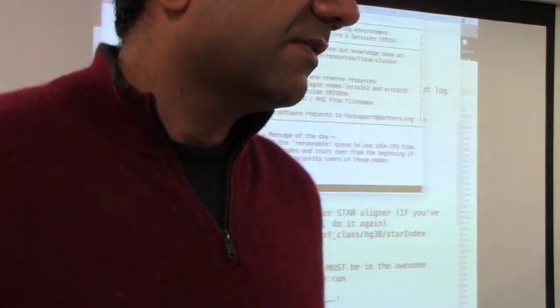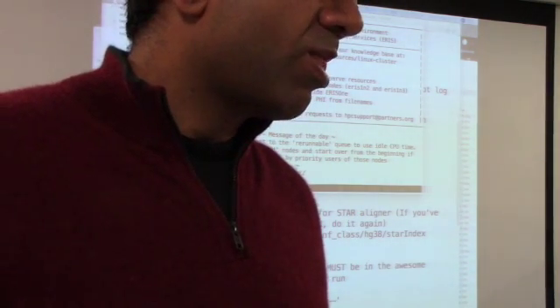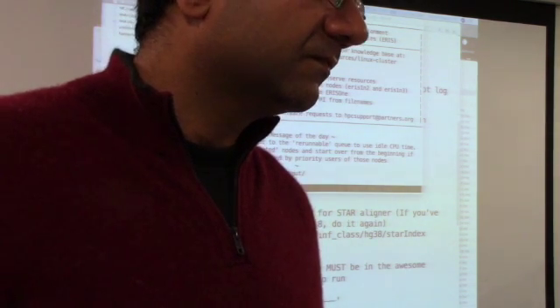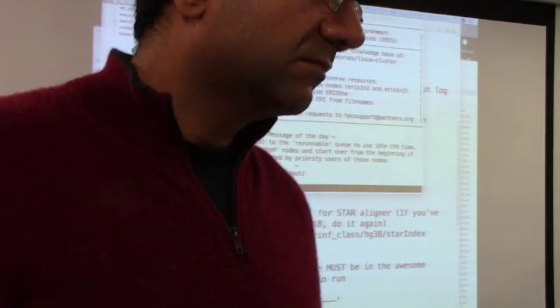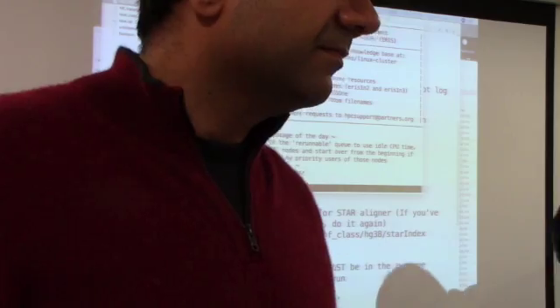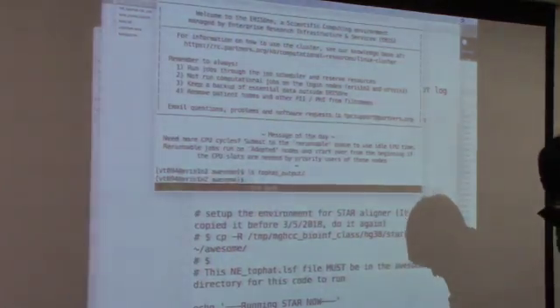Will it put, so if I check the files that are in my awesome folder and the Top Hat output folder, will they appear? In the end, it'll appear. So right now I don't have all of the ones that it should create here.